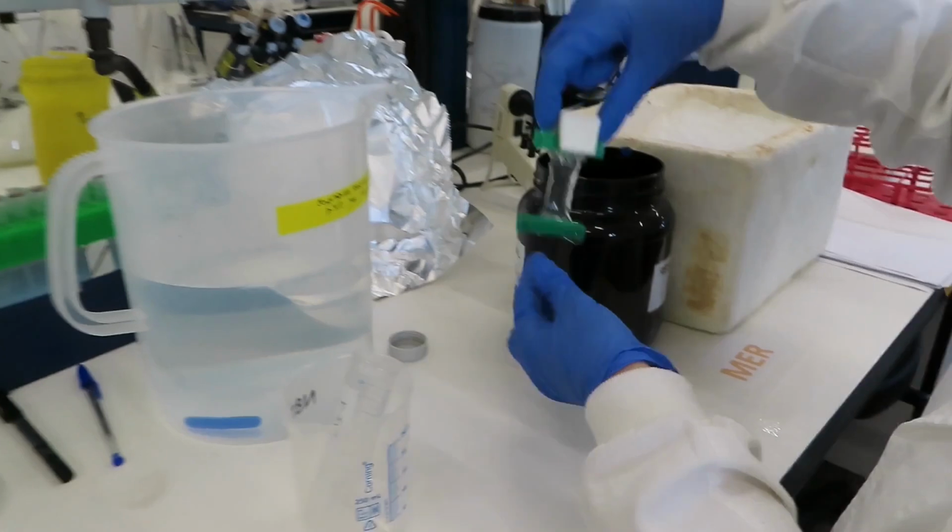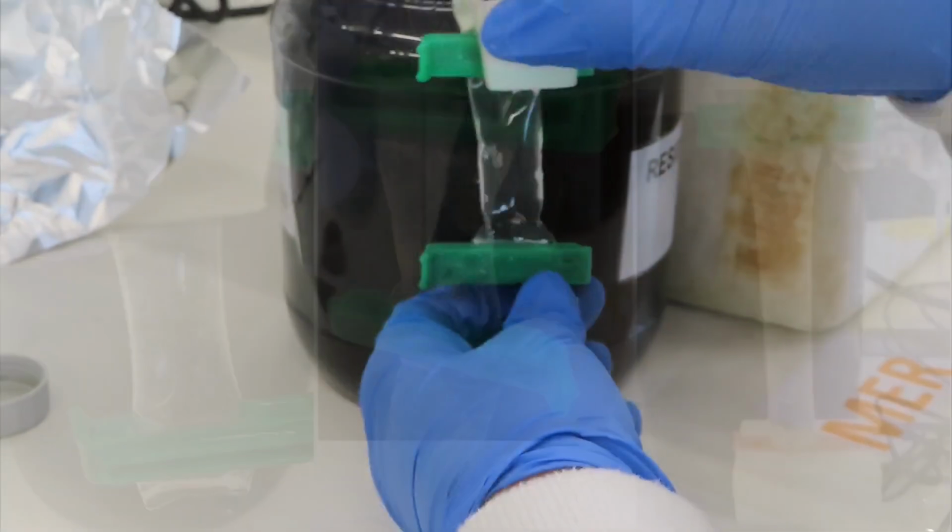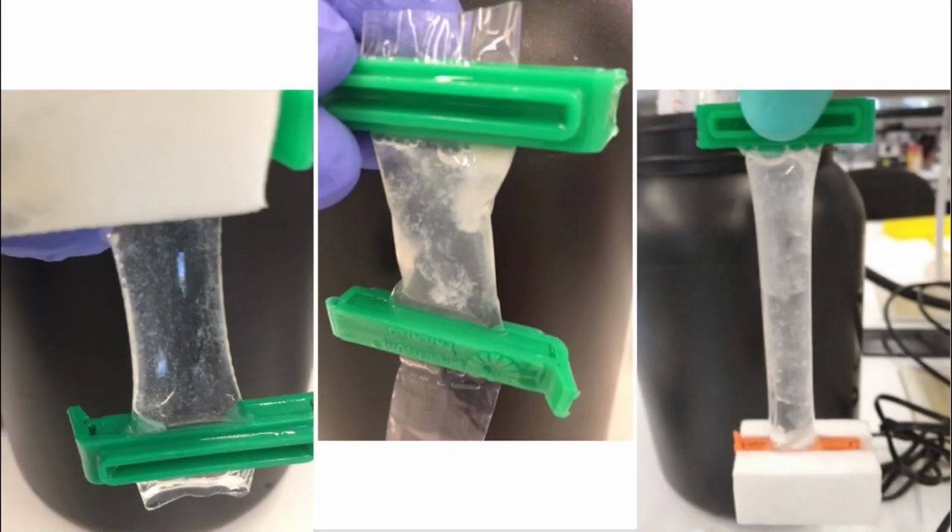Once the dialysis has finished, we check the presence of protein aggregates. Here, in this picture, several degrees of protein precipitation can be seen. This phenomenon occurs sometimes after the dialysis when the chosen buffer isn't compatible with the purified protein. In these cases, the protein can undergo structural changes exhibiting hydrophobic regions that will promote its aggregation.